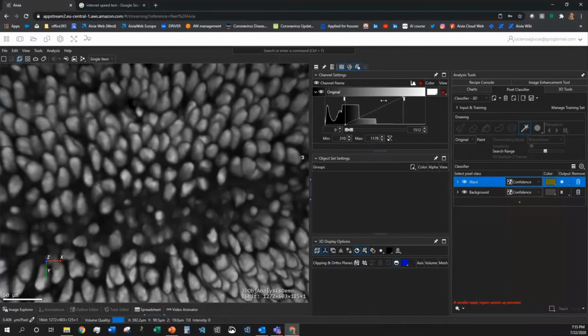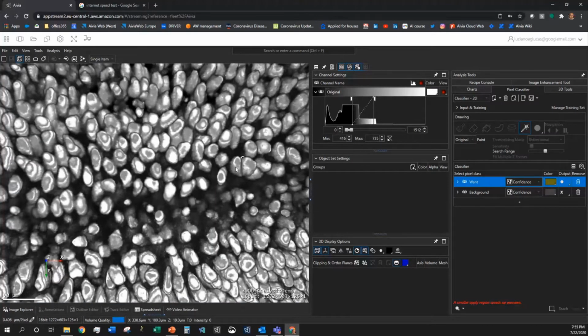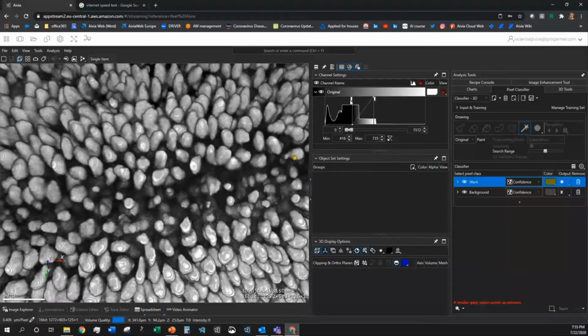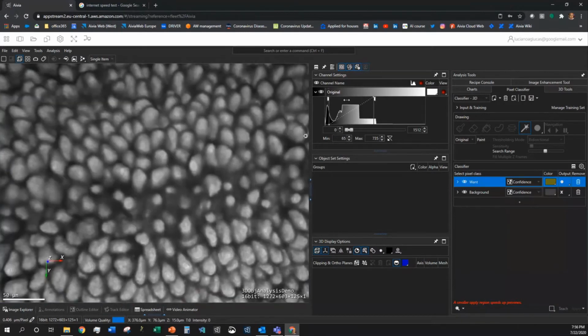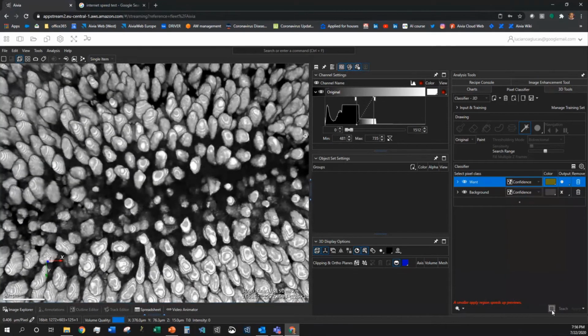It is important to do that because the magic wand is going to interact with what is visible, not the, let's say, raw data, but what you decide you want to choose. So if I set the view like this, it will interact with the voxels that are visible right now. And if I set the view like that, it will interact with these voxels that are visible now. So it is dynamic, and we made that by design.